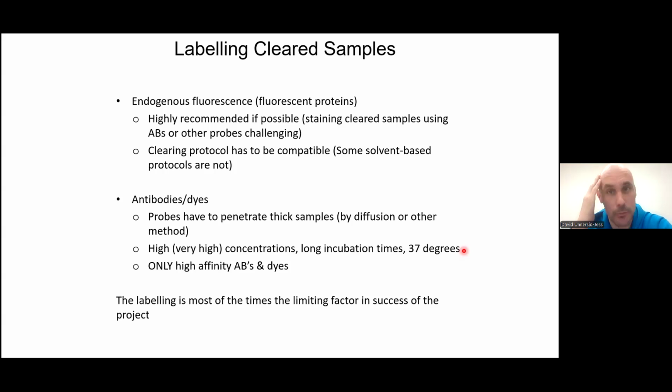And then one slide about labeling cleared samples. This is where you typically end up in trouble. If you can work with samples with endogenous fluorescence, this is always preferable, because then, of course, you don't have to introduce any probes into your large and thick samples.